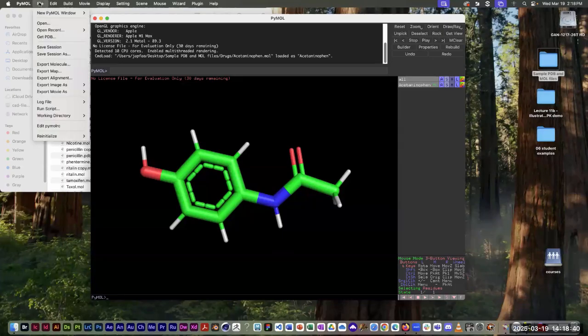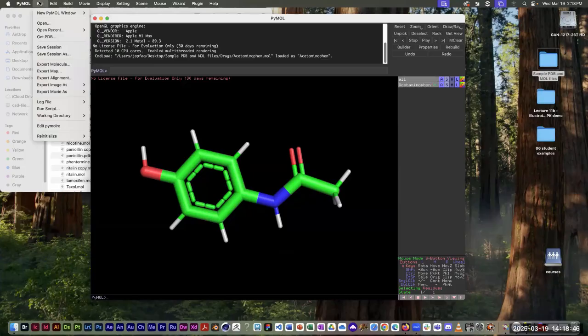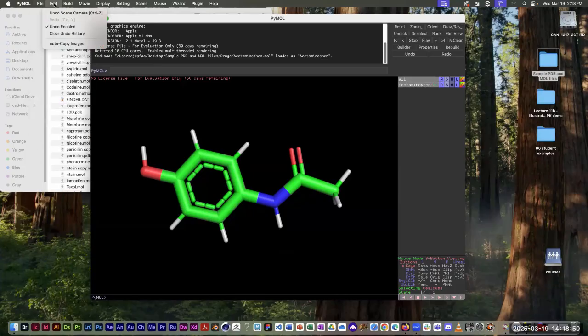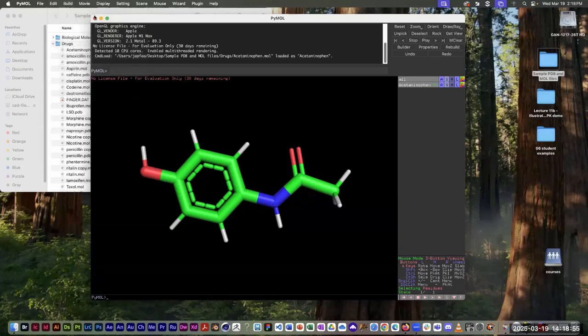I don't know if that's got something to do with the particular file or something else going on. It may just be that one file. So let's see.